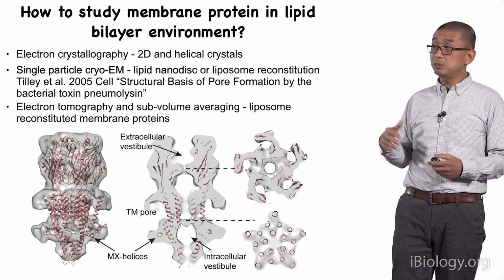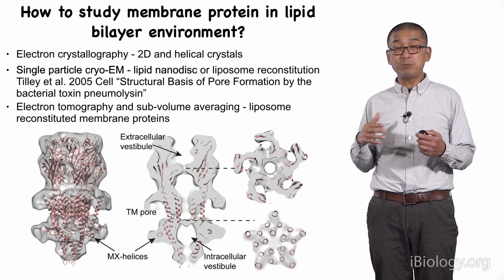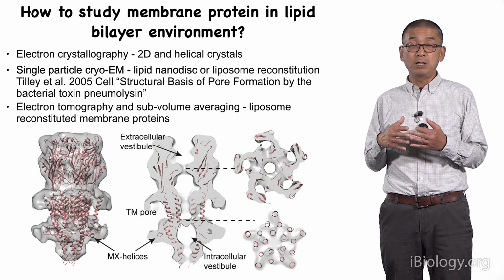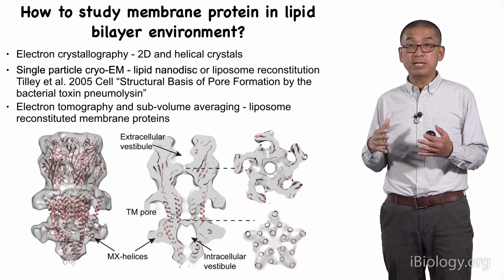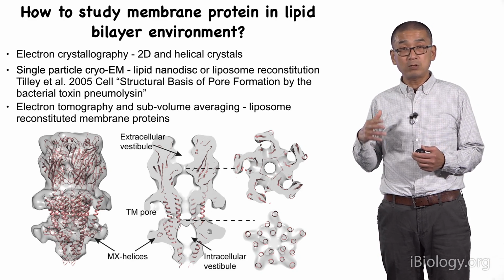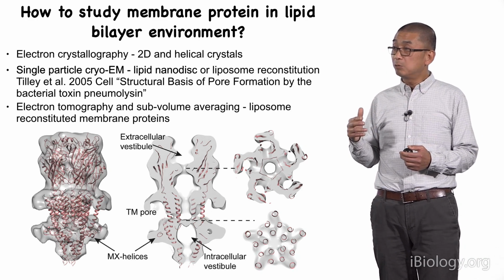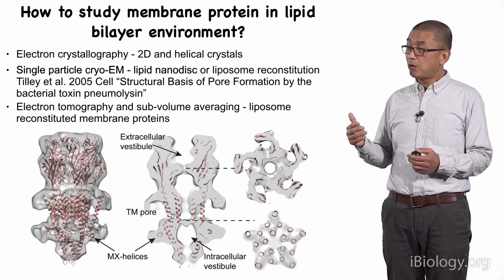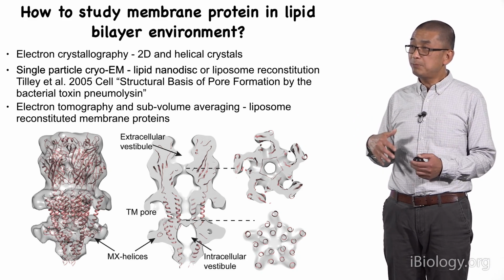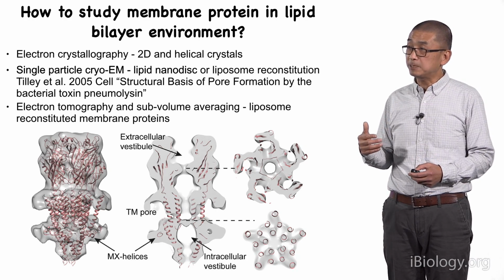One other approach still uses liposomes, reconstituting the membrane protein into liposomes, but taking electron tomography using the subvolume averaging technique to try to obtain the 3D structure of a membrane protein in the lipid environment. The resolution of this approach is currently also limited to around a nanometer. Now, for our laboratory, we want to try the approach of using lipid nanodisc.